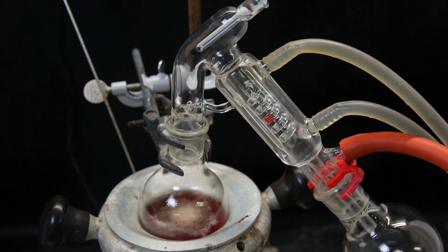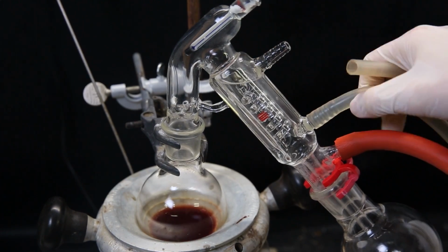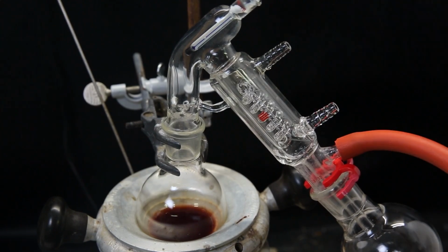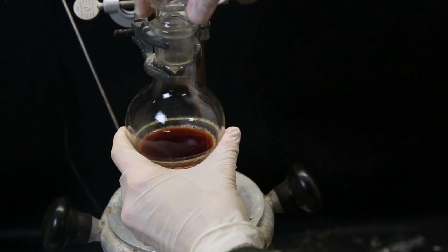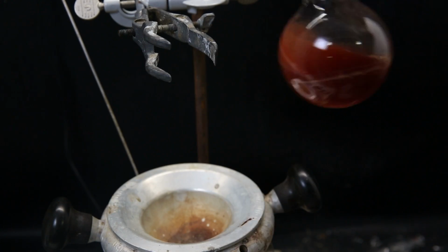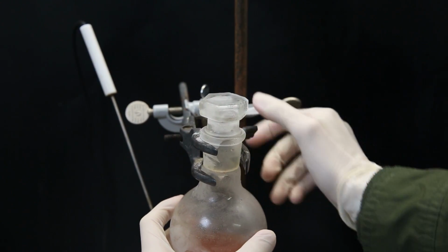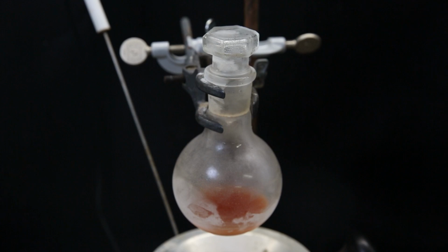I continue the distillation. When only a little is left, some solid has already precipitated out, and I stop the distillation. I then take the flask and move it to the freezer and leave it at -25 C for a day to crystallize out more solid. When I come back, I take it out of the freezer and it seems more solid has crystallized out.